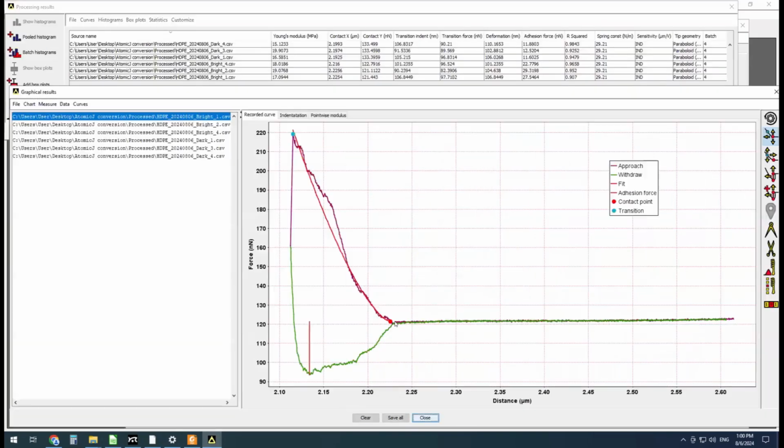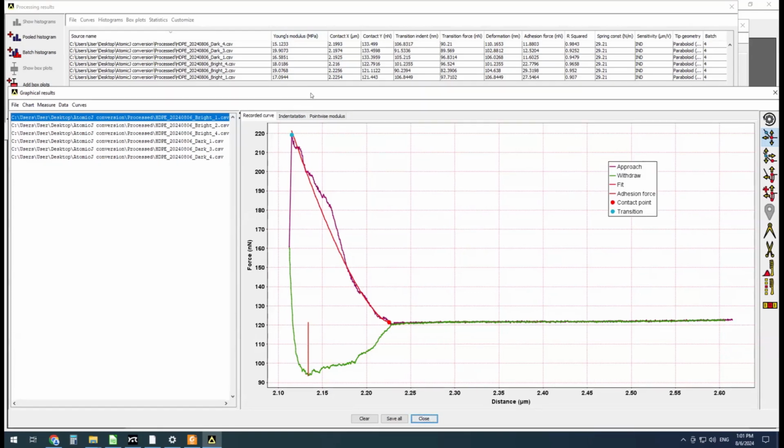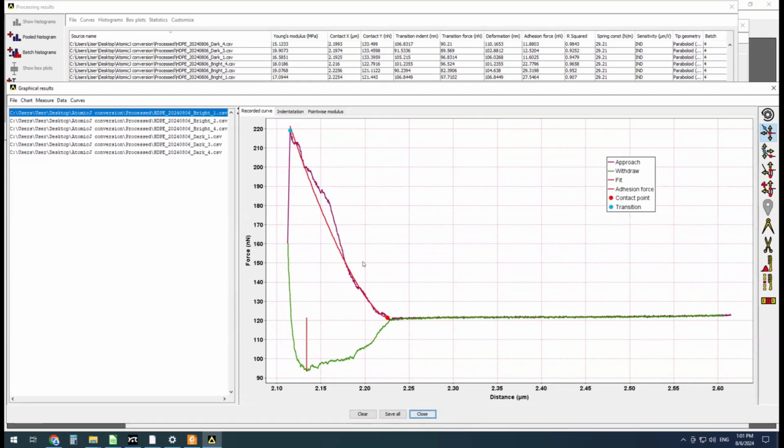and finish. Yeah. So now we have our analysis, both in Young's modulus. That seems a little low for something like HDPE. I think it should be in the hundreds of megapascal range. So probably some finer tuning of those fitting parameters is needed. Maybe the tip area is wrong, things like that. That's where some sort of constant known material can help you with determining your tip size.